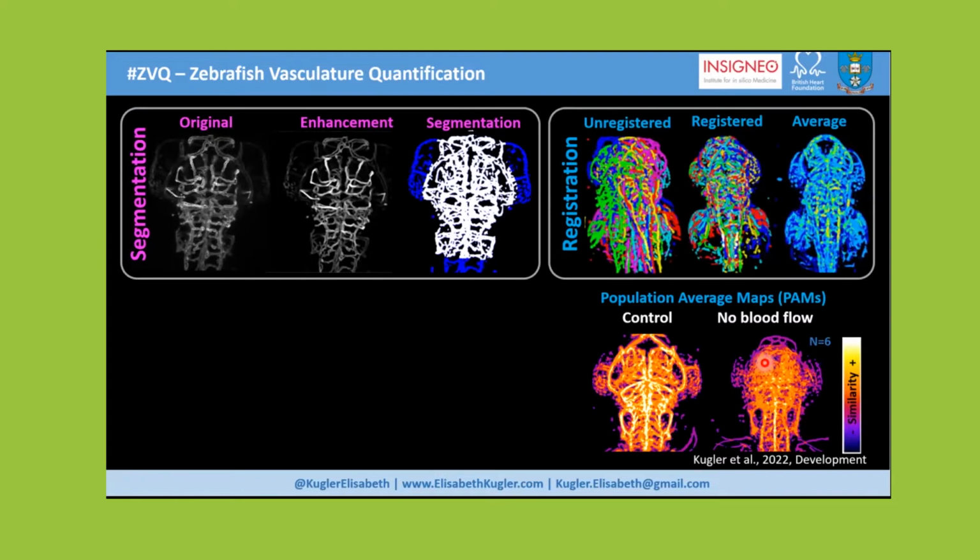Obviously you could then perform more quantifications, overlapping them, etc. But this is just to show that this is an approach to very briefly assess where there are patterns of similarity and variability, and how they differ upon, for example, treatment.